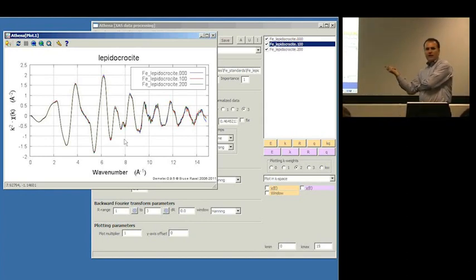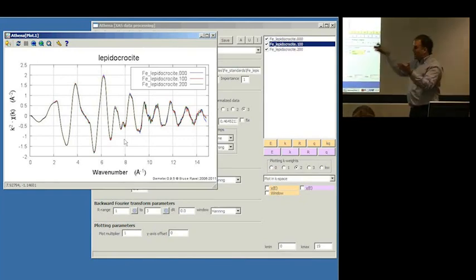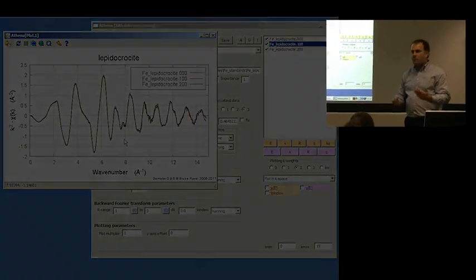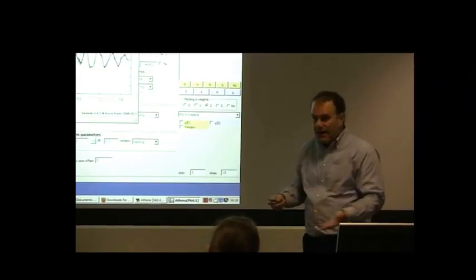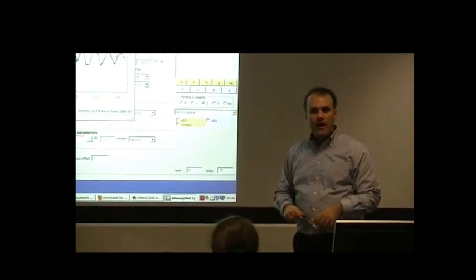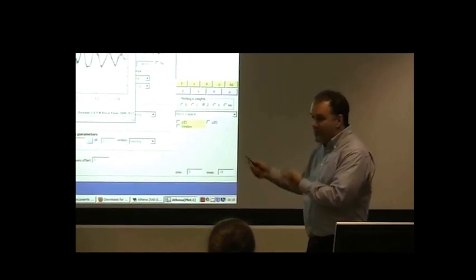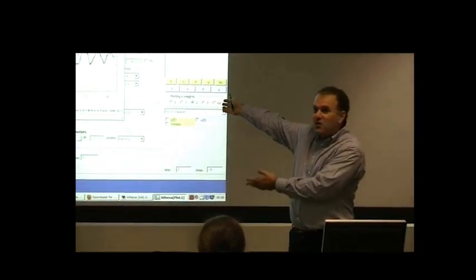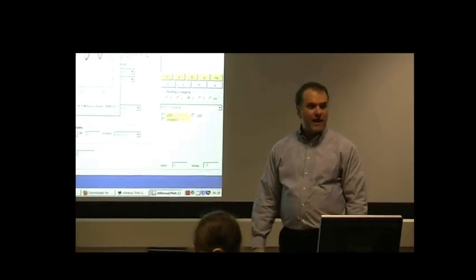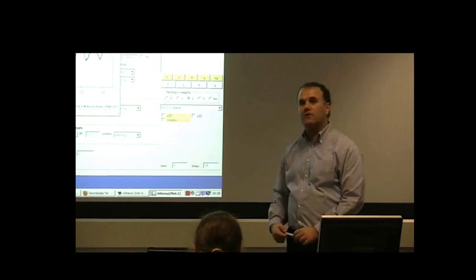But if things were still noisy, then you could estimate the amount of noise in the data compared to the size of the signal and do a little bit of math on the back of the envelope and figure out how many scans you would need to reduce the level of noise down below the level of the signal. And in a real research problem, with a real sample that's probably vastly crappier data than what I'm showing you right now, that's an exercise you would have to go through to decide how much you're going to have to measure on a sample to turn it into useful, analyzable data.